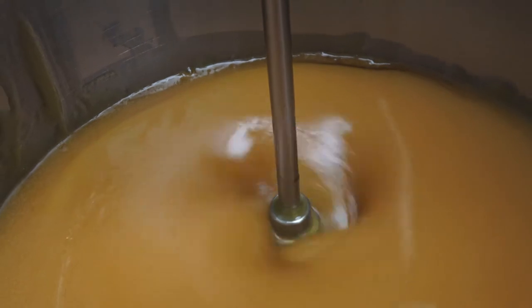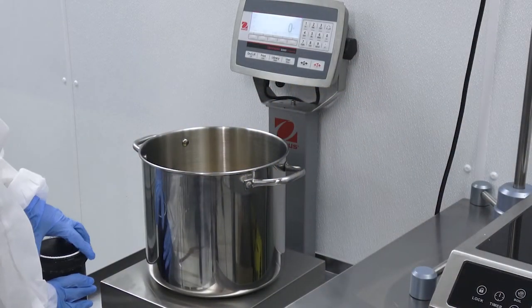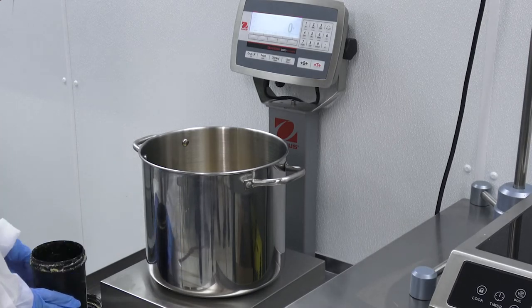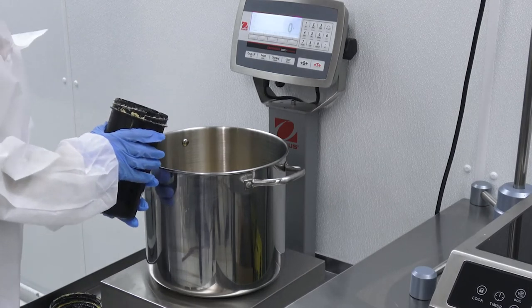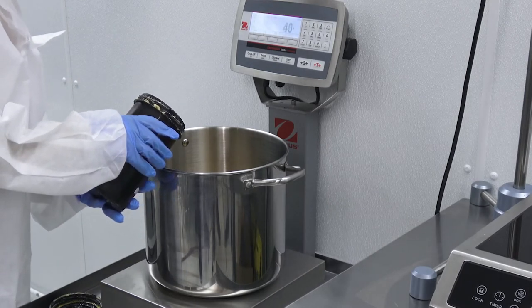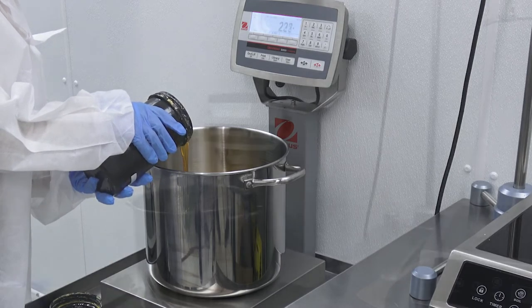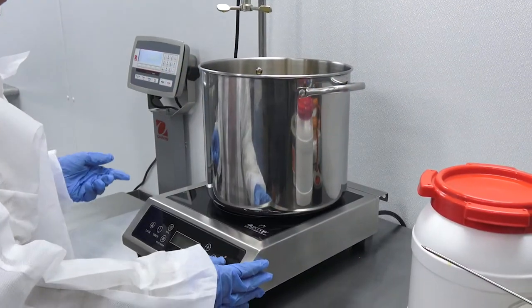When the contents of the vessel reach 60 degrees Celsius, we're ready to add the active ingredient. Back on the scale, we add 600 grams of a broad spectrum distillate with 90% CBD content. Then place the vessel back on the induction hotplate and continue to mix.